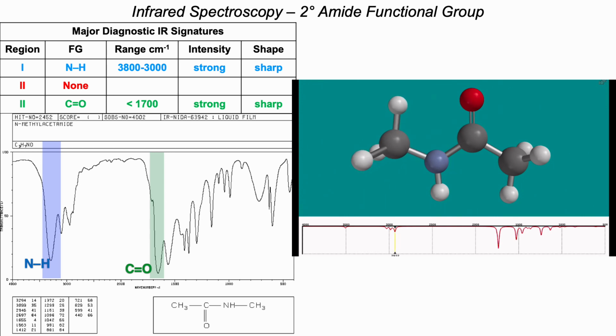So the important learning objective when you're interpreting IR spectra is to always keep in mind that even though the spectrum is a snapshot, in reality what is happening is the IR light is perturbing the dipole moment of that functional group bond. So that's why you're seeing the response in terms of the spectrum. So moving on now.